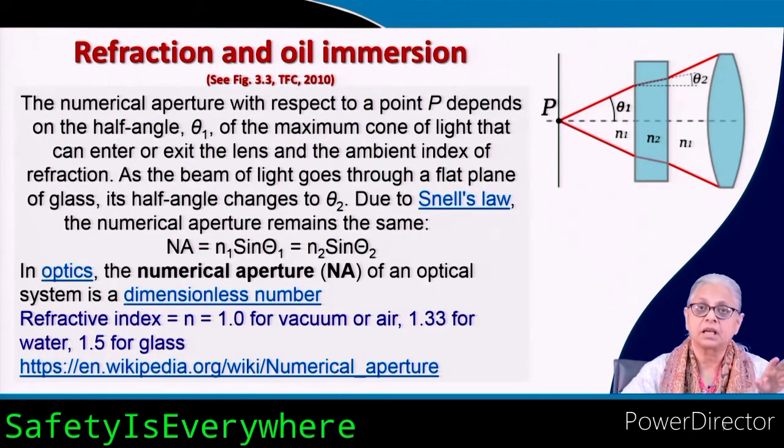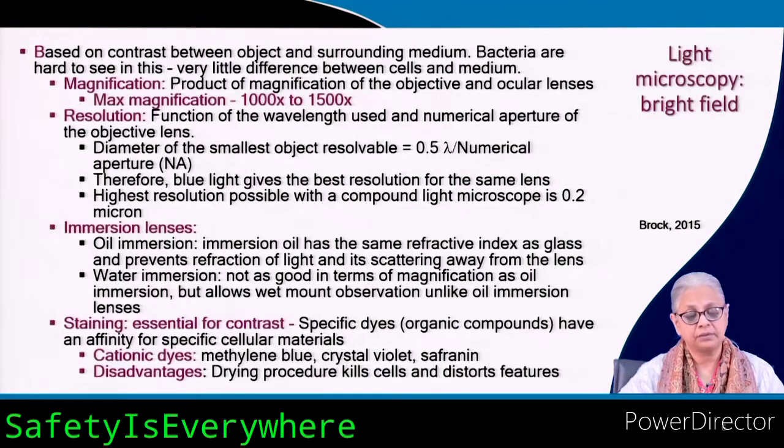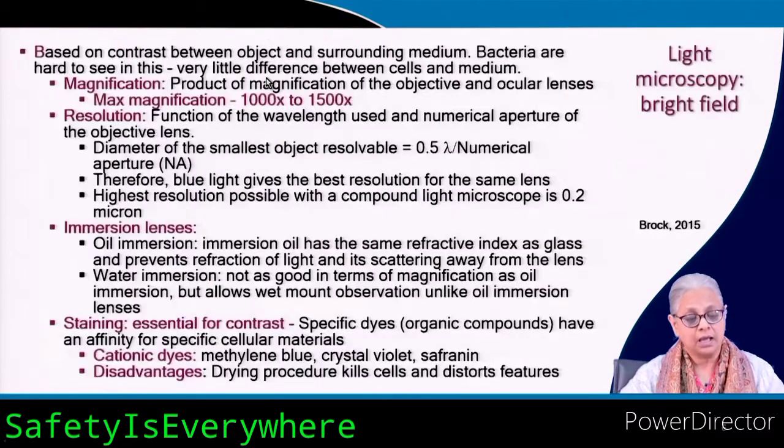That is one issue. And the second thing is 1.33 is the refractive index for water. So if you don't have immersion oil, you can use water. Okay, so water will give you better results than air, less than oil, but better than air. That's about it about refraction and oil immersion, and there's a lot more in the textbook. There are some very good graphics in the textbooks, so please refer to them for more details, and that will help you to understand what I'm talking about. Like I said, oil immersion gives you the best possible results as compared to air and water.